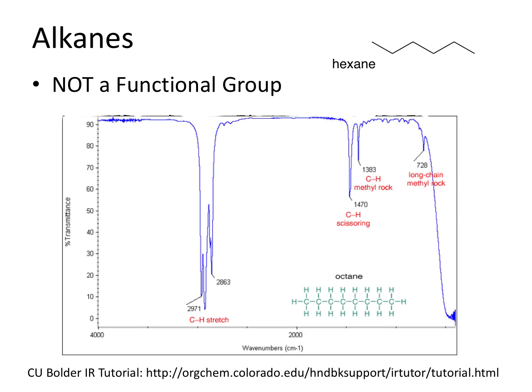So even though we're going to use IR to see the functional groups, we have to know that alkanes still show up. The alkane is the carbon part that doesn't really do anything, so we have to learn what to ignore. If you look at this specific molecule on the right, it's called hexane. Hexane is basically just an alkane. It doesn't have any special things, which you can tell because there are no letters for other elements, and there are no double bonds or anything like that. So that's the kind of thing we don't want to look at.